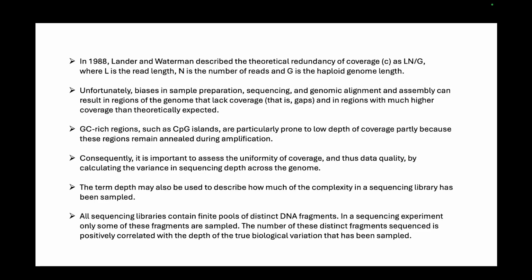So this is one of the examples where you have low reads, but it's not due to deletion or any kind of variation, but it's mostly due to GC rich regions, because you have not been able to amplify this properly. So these are like sequencing issues that come up, and that can give you low depth or low coverage.